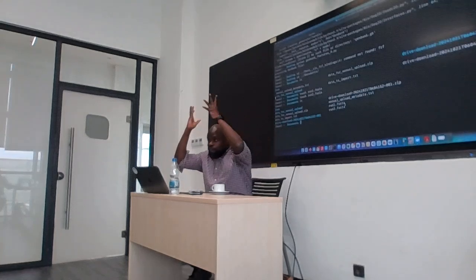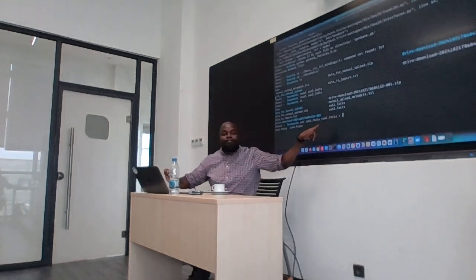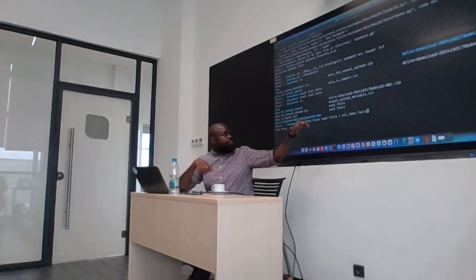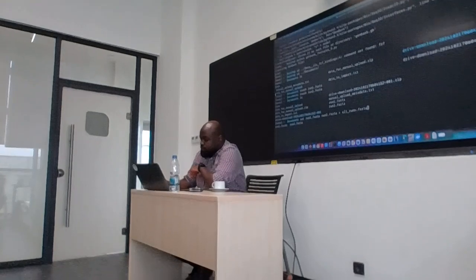And I want to join them together. So you can easily use cat run 1 run 2, and then I can use the redirect to point it to my new file. So I can say all runs .fasta. So all you need is to say I want to concatenate all the files into this file. And I'll hit enter.